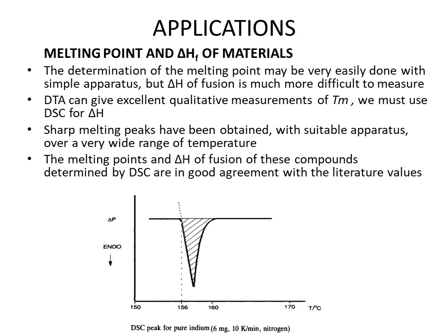Now we'll see the various applications of DSC. So first of all, melting point and enthalpy of fusion of various materials. The determination of melting point may be very easily done by using simple apparatus, but the calculation of enthalpy of fusion is much more difficult.